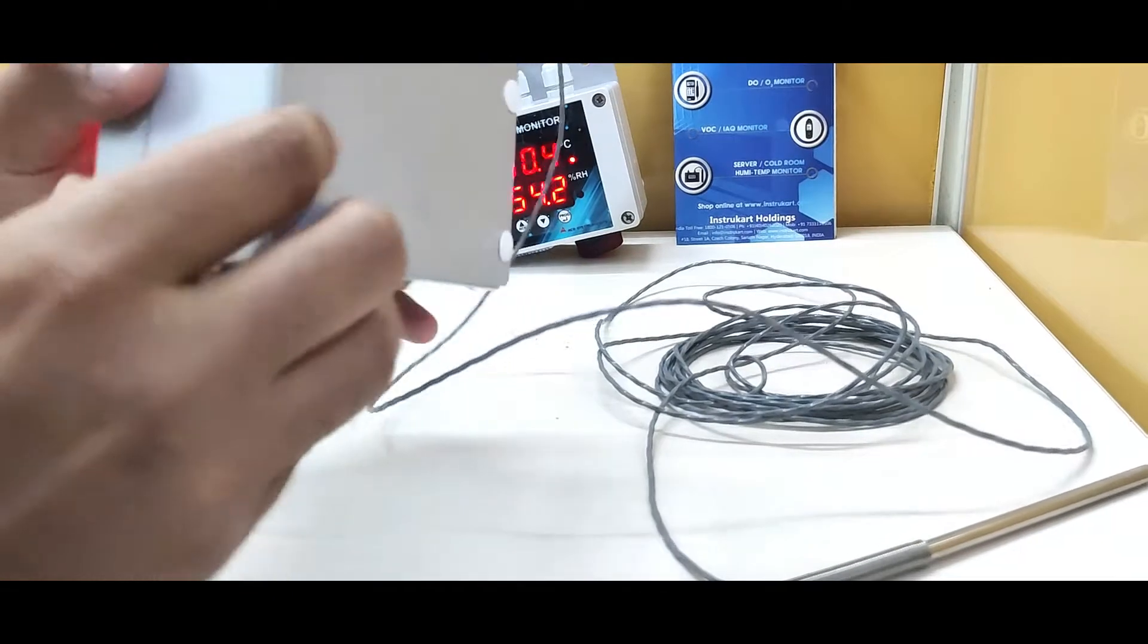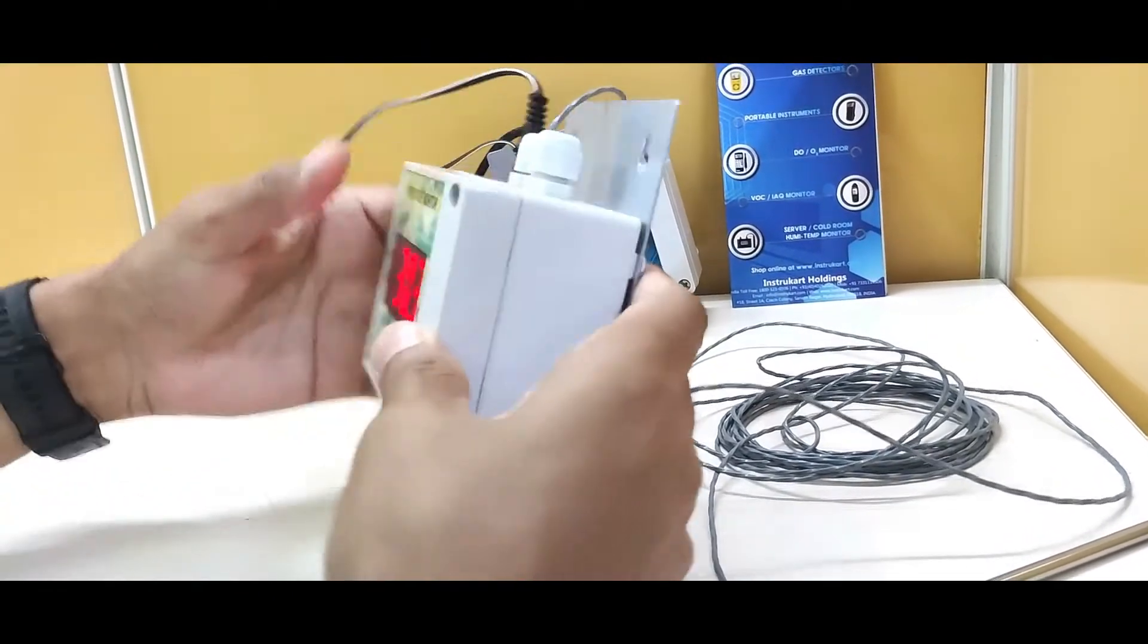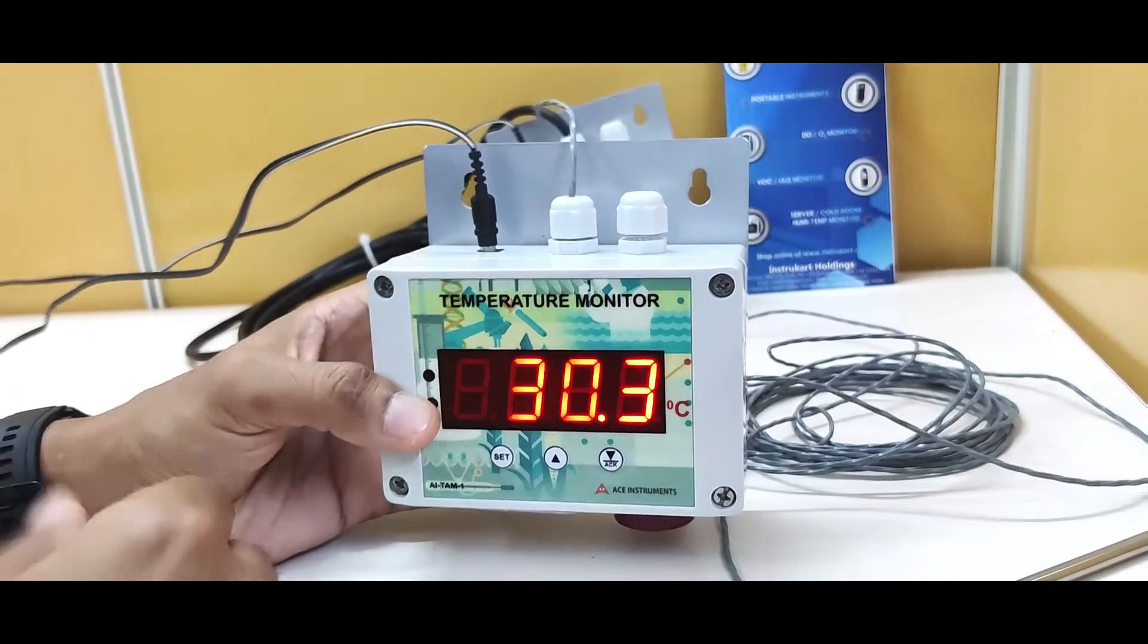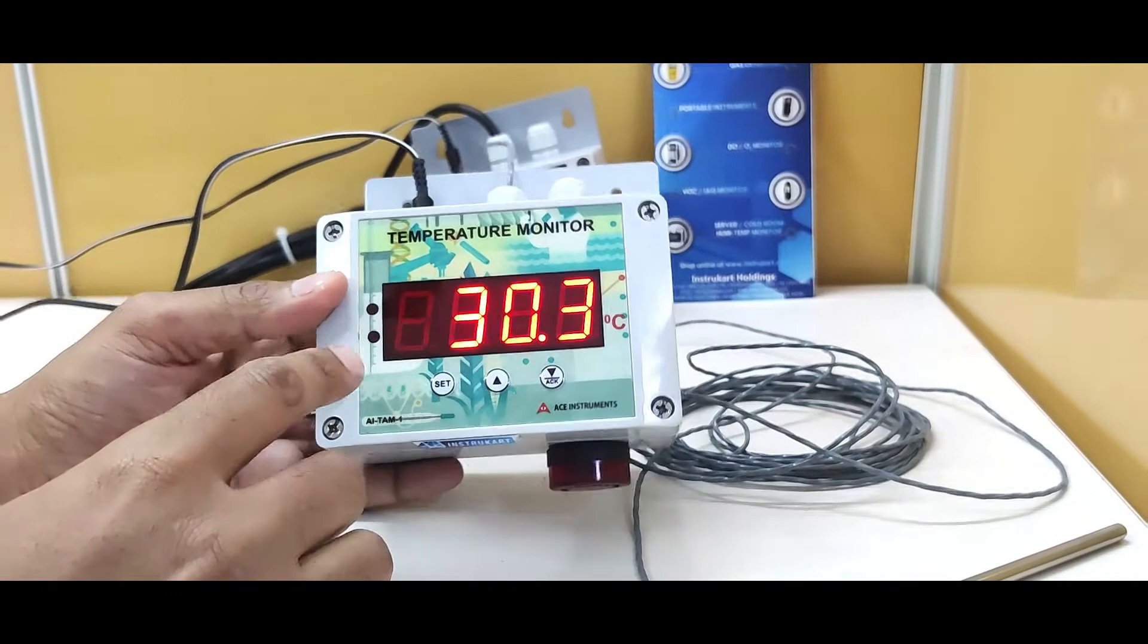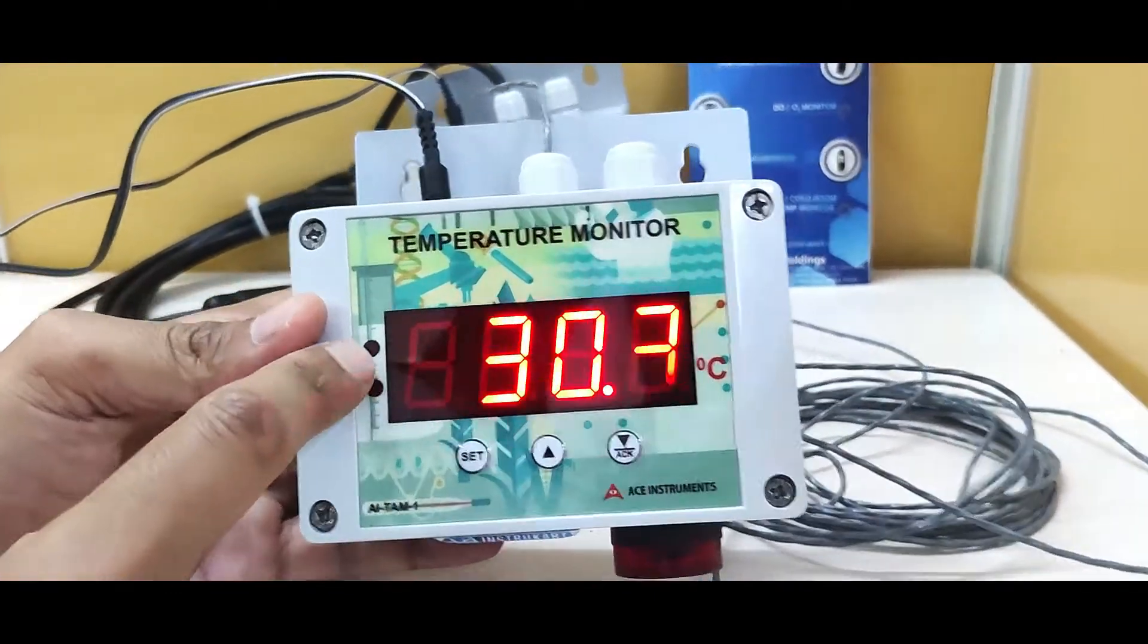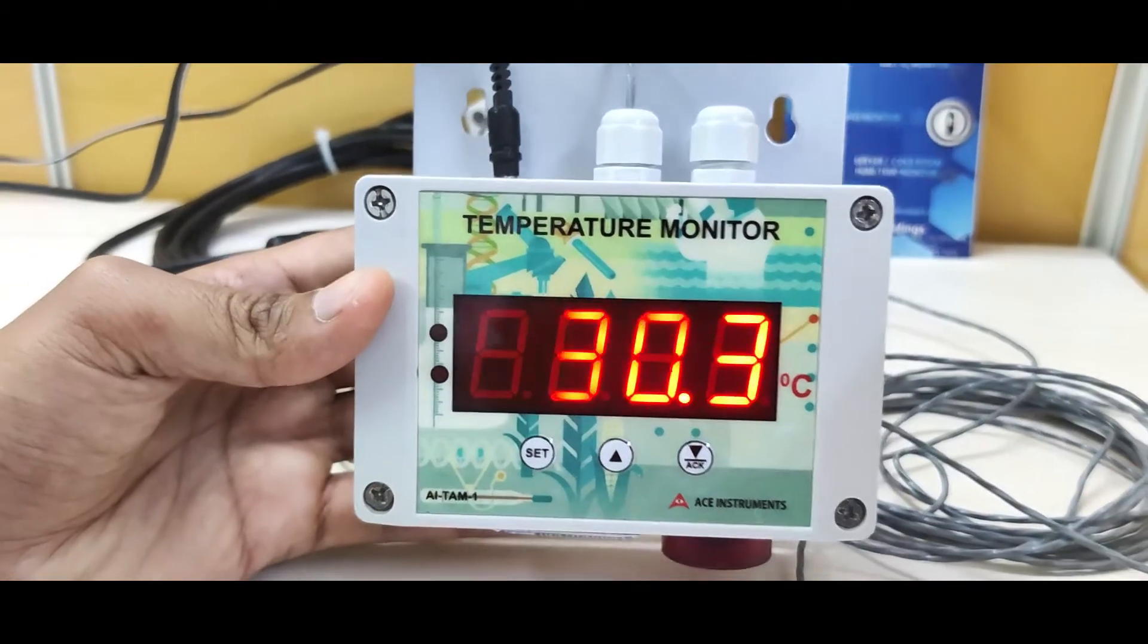At the back you can see the back plate provided for wall mounting, and the setpoints for high and low in case there is a setpoint violation.